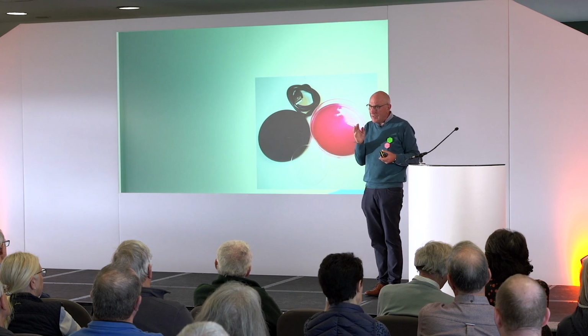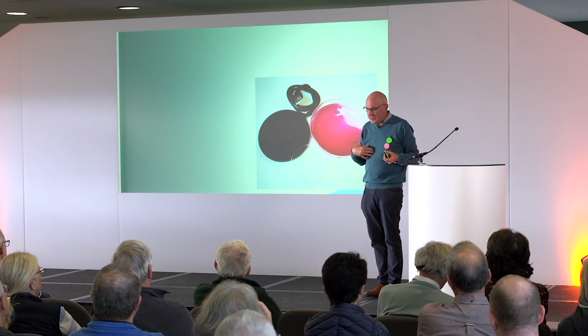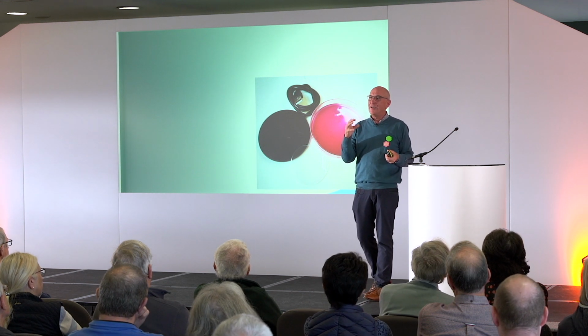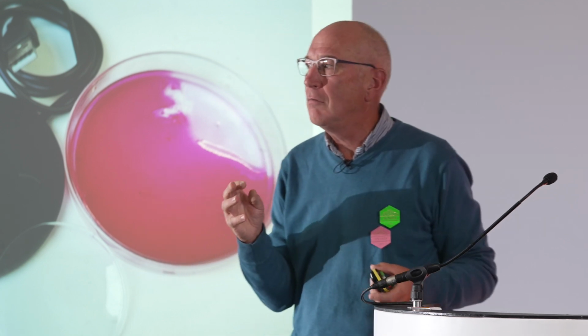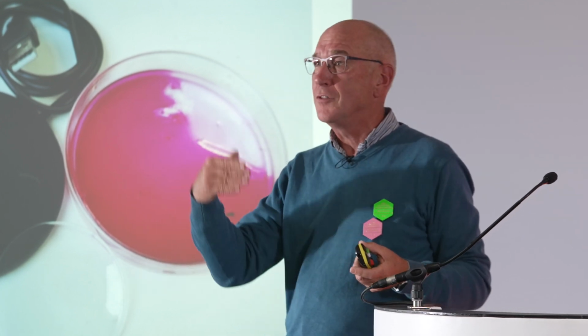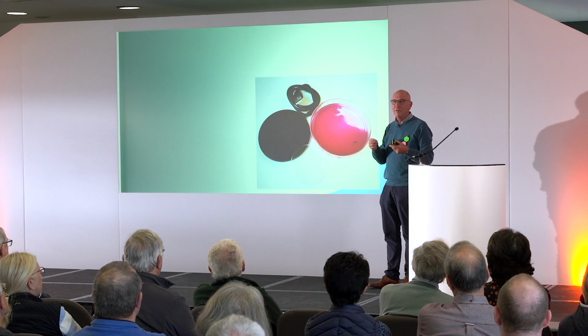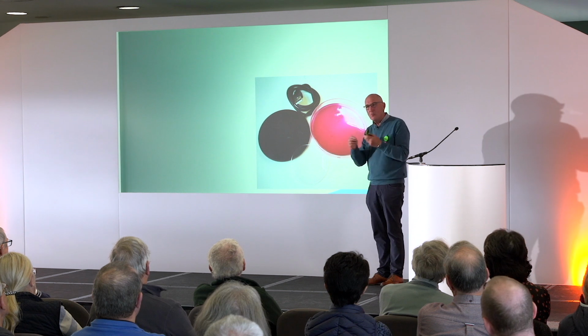Some people, myself included, like to make slides so I can get a good representative of the pollen. I'm not really that interested in having the perfect slide. But if you want to have a perfect slide and you want to come to the National Honey Show and present it, then you worry about air bubbles, and you maybe spend more time doing it.